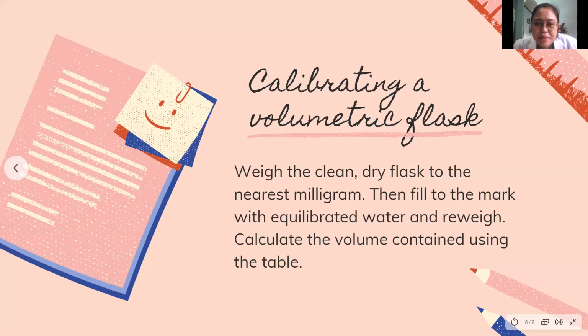Okay? Now, sa calibrating a volumetric flask, also the same thing. Parehas lang po og computation. Na-post na nako siya. You can access the PPT sa inyuhang Schoology dito sa laboratory class na course. Okay? Para naay copy. Pati ang katong PPT yesterday na-post sad siya dito para pag-abot sa exam, maka-answer pud mo og tama.